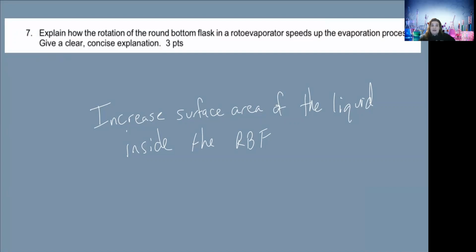It's the drying step, right? During the drying step, when you're done with small scale crystallization, if you take the pure trimyristin that you have extracted and increase the surface area along the test tube, it'll dry faster overnight. So increasing the surface area could help in a lot of different ways. Just keep that in the back of your minds.